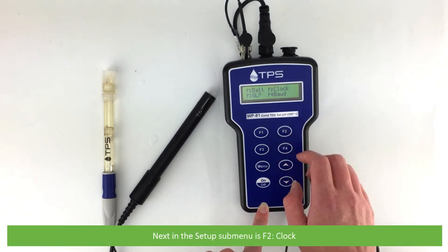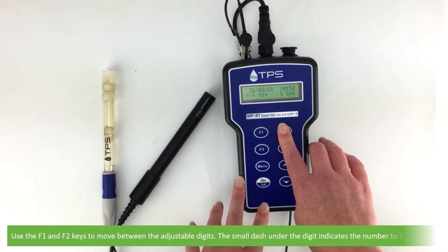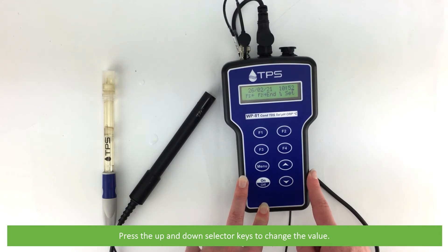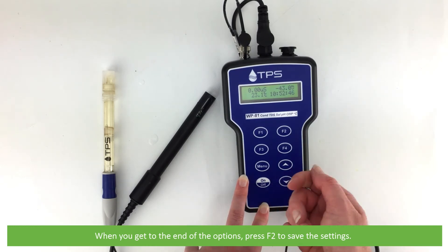Next in the setup submenu is F2 clock. Use the F1 and F2 keys to move between the adjustable digits. The small dash under the digit indicates the number to be adjusted. Press the up and down selector keys to change the value. When you get to the end of the options, press F2 to save the settings.